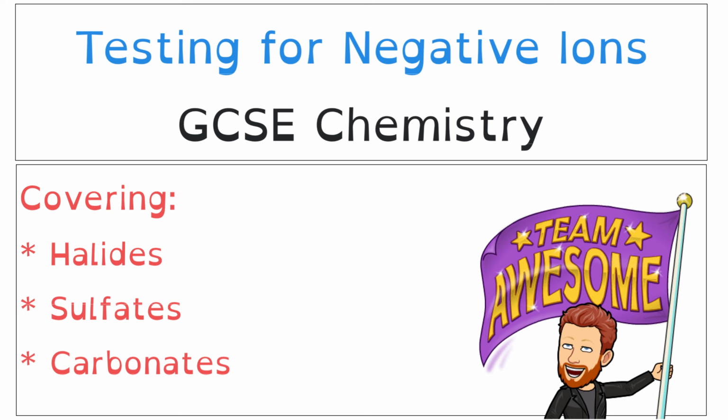Hello and welcome to this GCSE chemistry video about testing for negative ions. In this video we'll cover 3 different negative ion tests, starting with the halide ions, moving from there into sulfates, and finishing by looking at the carbonates test.